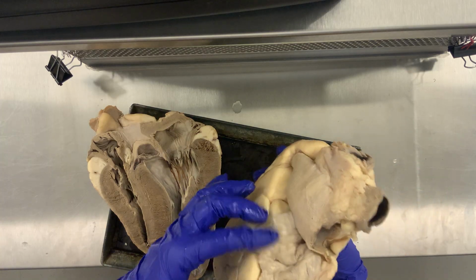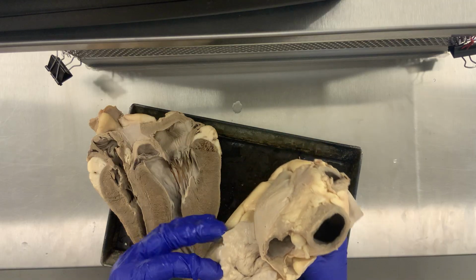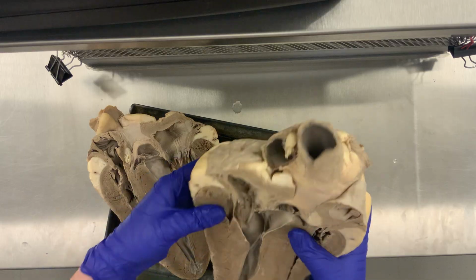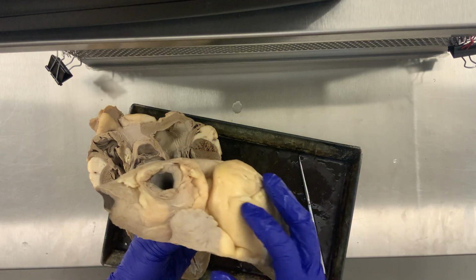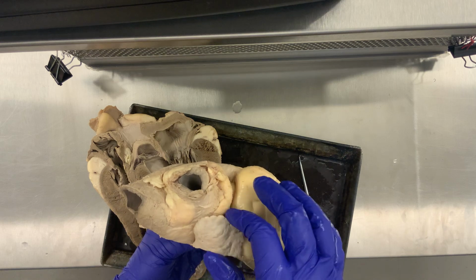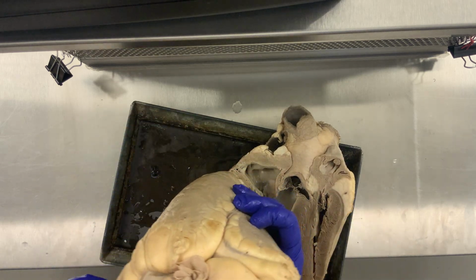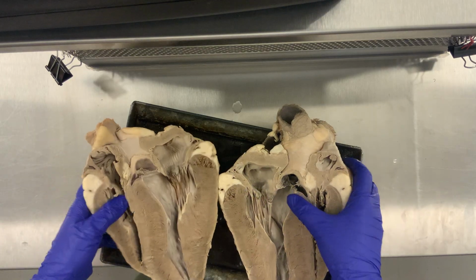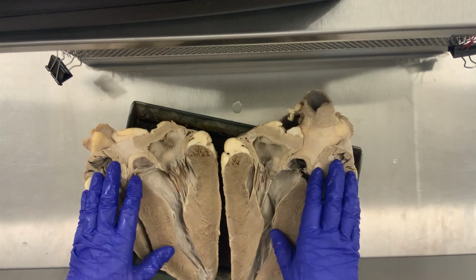Here on the outside, we also have auricles. Auricle literally means little ear, and they sit on top of the atria. So here, because we can see this is the left atrium, we have the left auricle, and here we have half of the right auricle. You can see them on this side as well, so be able to recognize that really specific tissue shape as the auricles. And that is the cow heart.